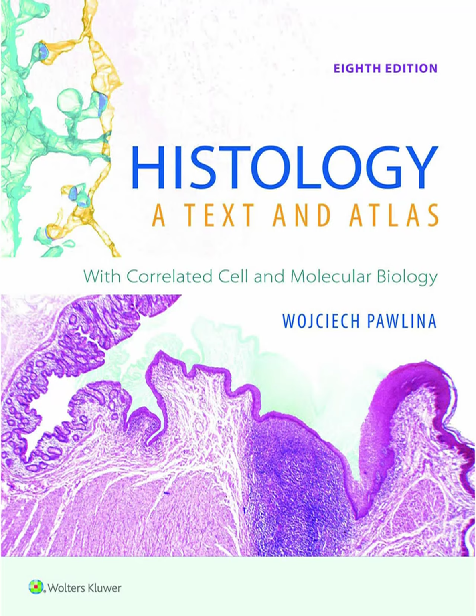And a really neat trick with formaldehyde is that it doesn't significantly change the 3D shape of most proteins. Oh, that's important. Yes, very important. Especially for some of the more advanced techniques later on that rely on specific molecular shapes, like immunocytochemistry. Okay, so the tissue is fixed, preserved like a tiny, delicate artifact. What happens next to get it ready for slicing? Because you can't slice something soft, right?